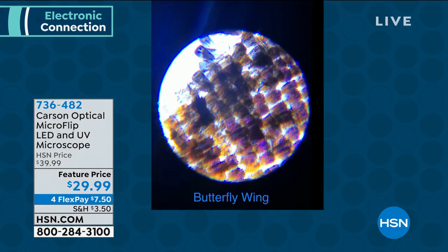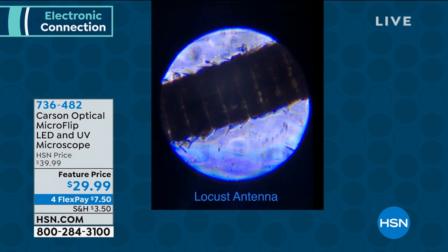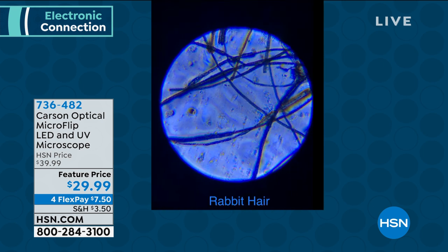I mean, super cool. I'm just going to scroll through. Am I going the right way? Go that way. There's a dragonfly leg. So awesome. That is a locust antenna. Look at the little hairs on there. How else would you be able to look at this? This is a scale from a goldfish. And now Doug, everybody gets these, correct?